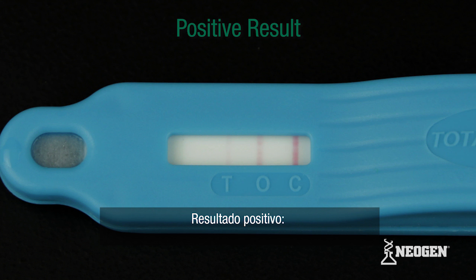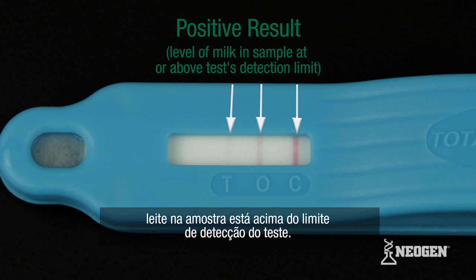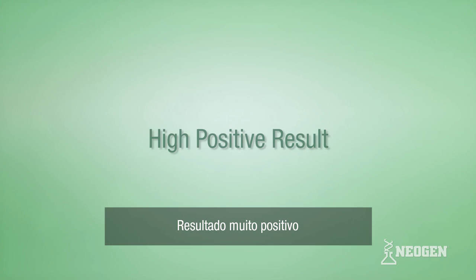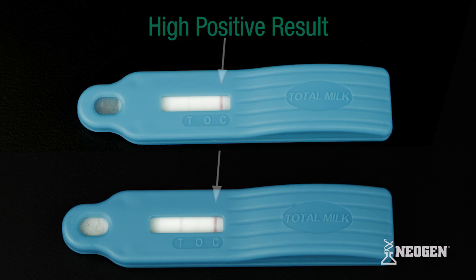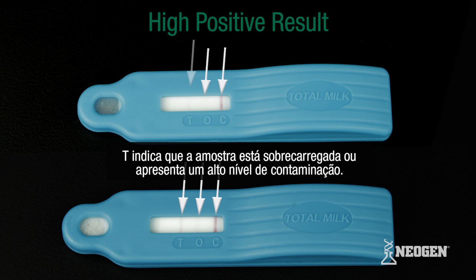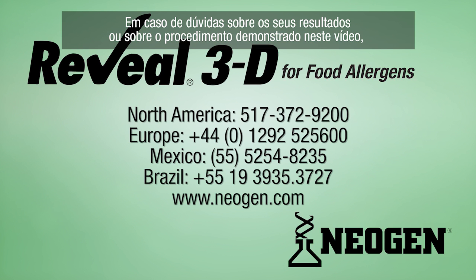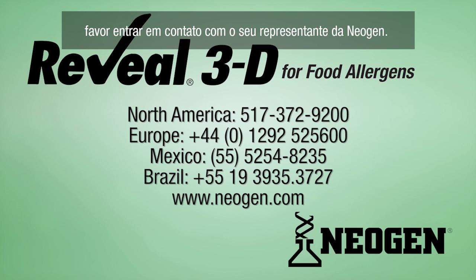For a positive result: lines visible at positions O and C, together with a line of any intensity visible at position T, indicates the level of milk in the sample was at or above the test detection limit. For a high positive result: a line visible at position C, no line visible at position O, and a line visible or absent at position T indicates the sample is overloaded or has a high level of contamination. If you have a question about your results or any of the procedures demonstrated in this video, please contact your Neogen representative.